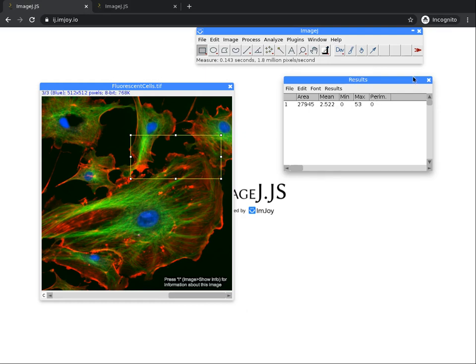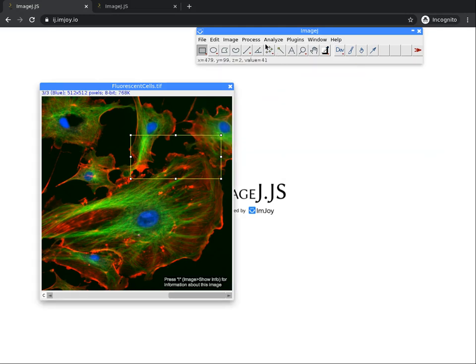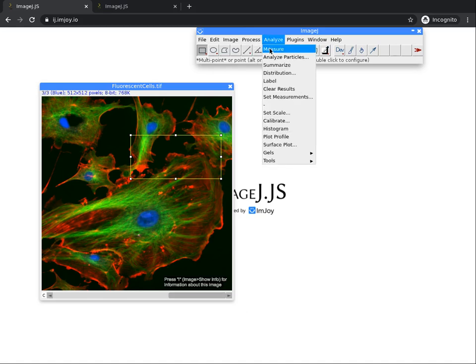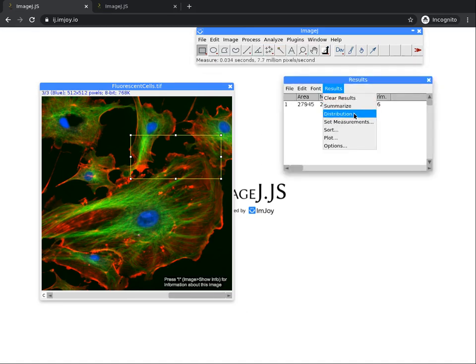This is because your computer didn't actually analyze the values of your selected area. So then you can close this tab and then reopen and restart the measurement. Here now we have numbers wherever they're supposed to be.